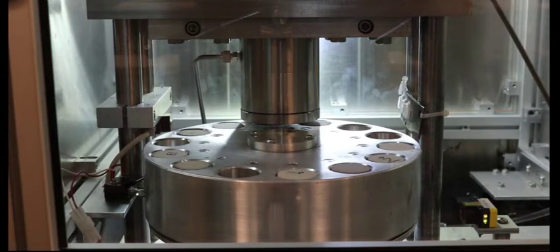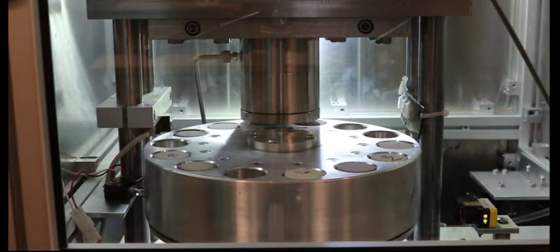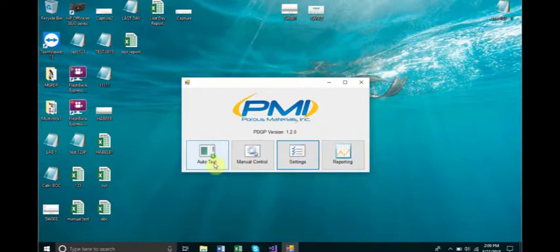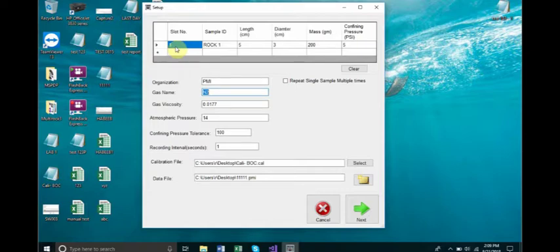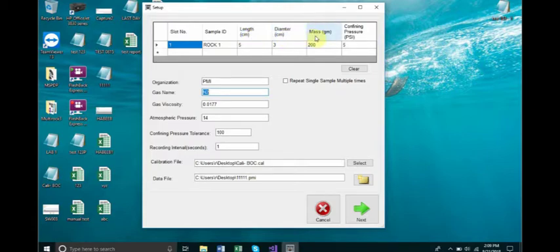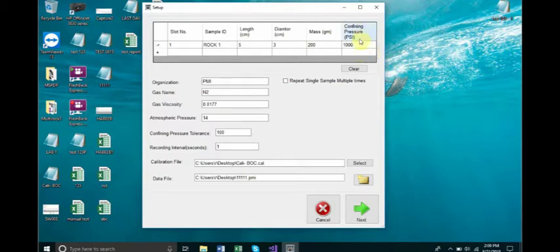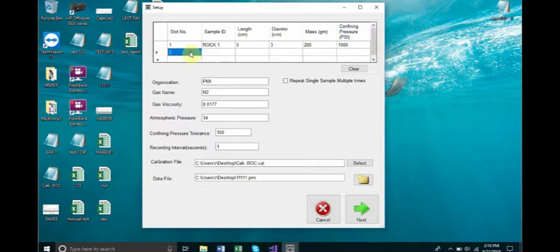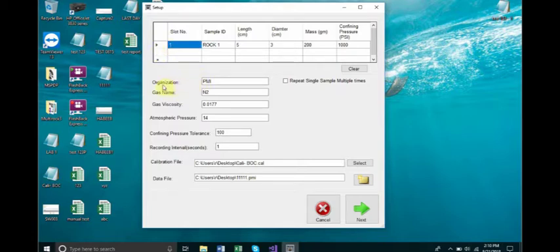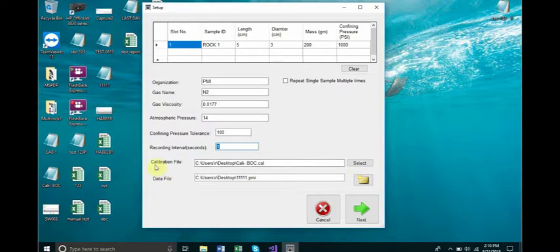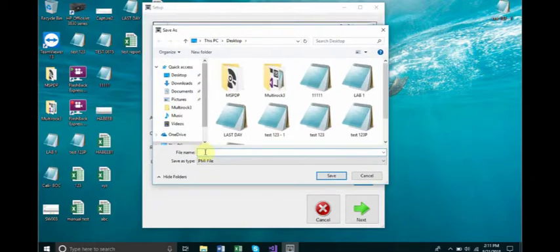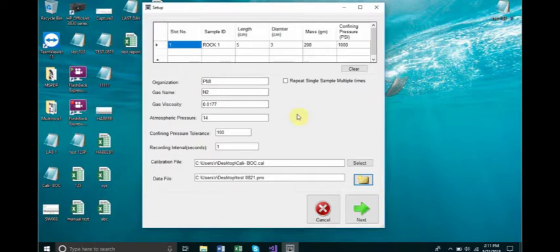We will now walk through the steps to set up and run an auto test. From the main menu, click the auto test button. Starting from the top of the window, you may enter parameters for the sample or samples to be tested. Enter the slot number into which the sample has been placed. Enter the other characteristics for the sample and repeat for any additional samples to be tested. Below the sample characteristics table, enter data into the fields for other test parameters. Enter the organization name, gas name, gas viscosity, atmospheric pressure, confining pressure tolerance and recording data interval in seconds. Choose a calibration file created by the calibration procedure and then choose a file path for the data that will be collected by the test. When these steps are complete, click the Next button.